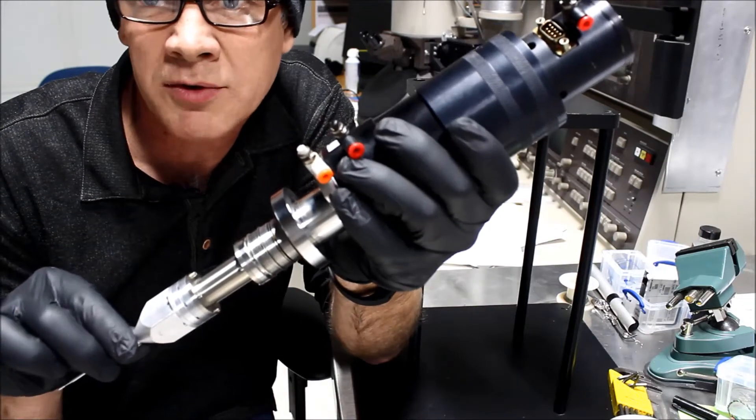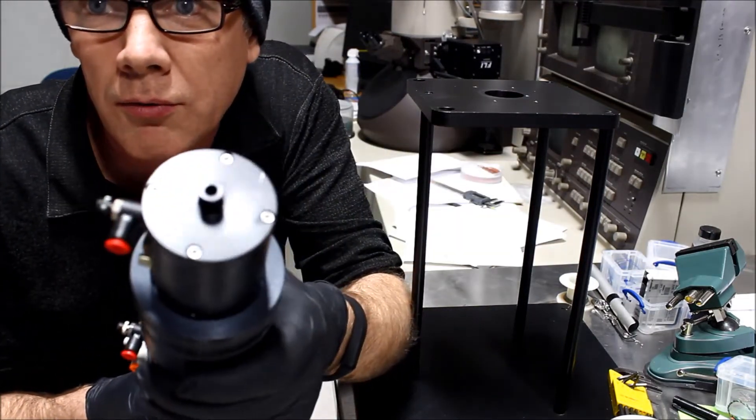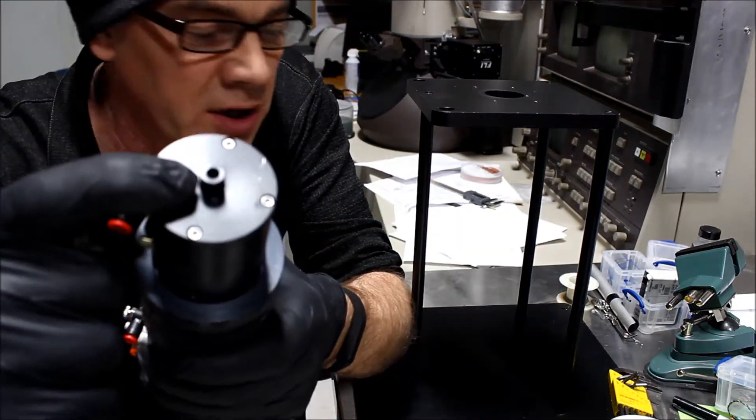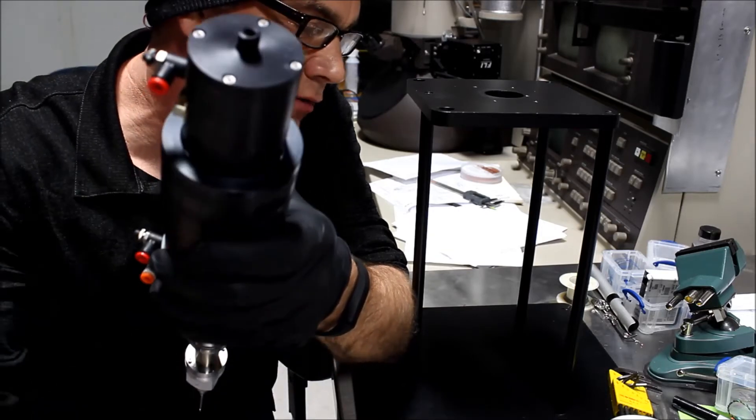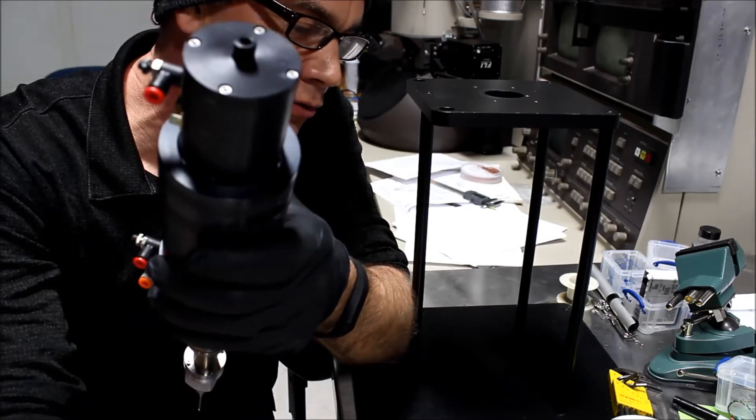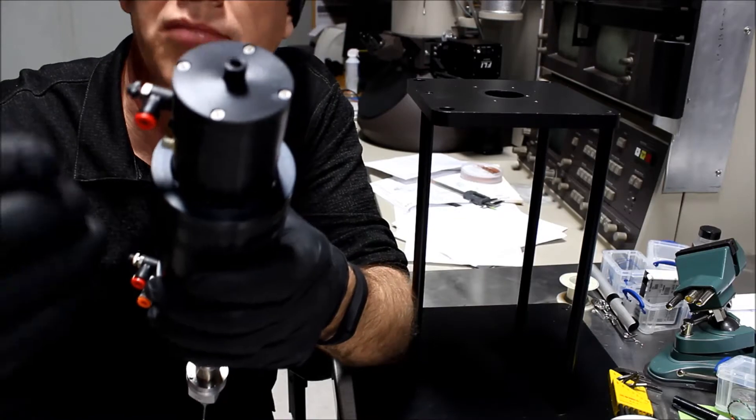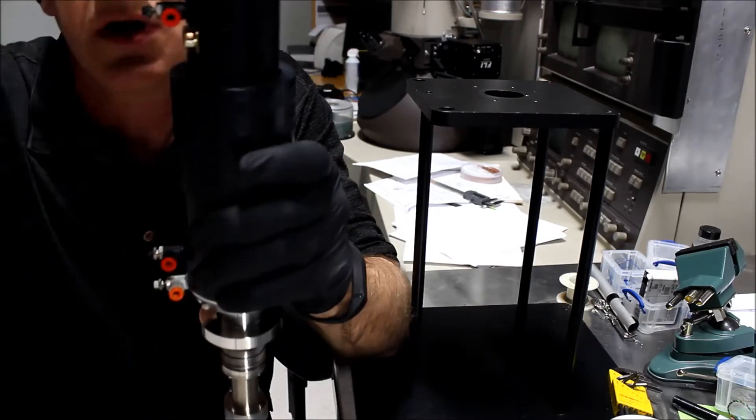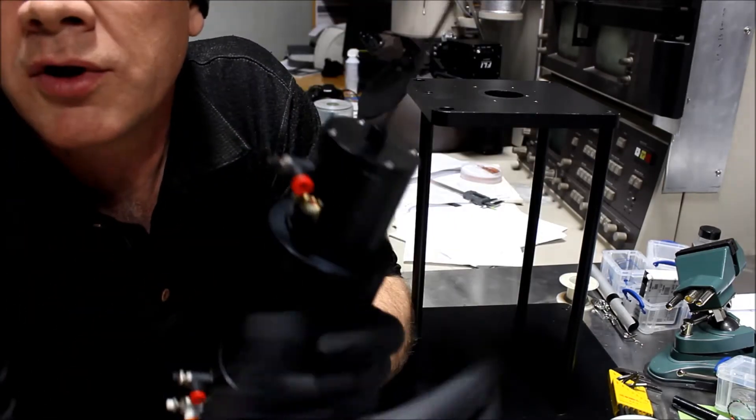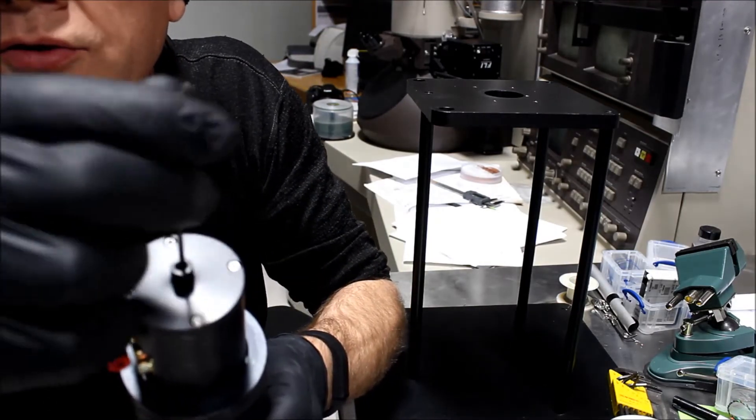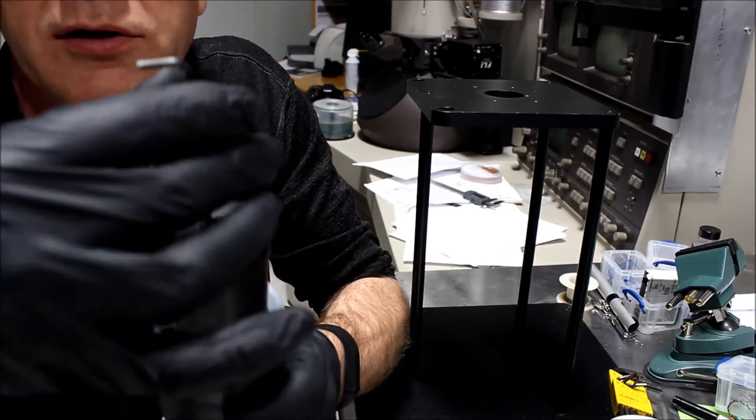We're going to turn this little thumb screw on the end. To do that, we have to take a 3/32nd ball driver and we have to loosen the set screw in the end. We just poke it in the little hole in the end, turn it counterclockwise, and that loosens the set screw.